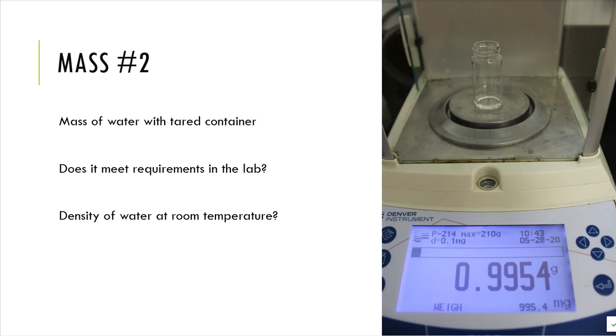Now here's the issue. They give you a number that this should be in the lab, and they're telling you, hey, listen, just double check your number after this, and you're going to see that in the grade sheet. If I use this micropipette the proper way, then that value should be pretty close to what they're telling me in the textbook. If I think that I used 1 milliliter, but I used the micropipette in a wrong way, and that's very common for people that do not have a lot of experience with the micropipette, then that amount might be a little off.